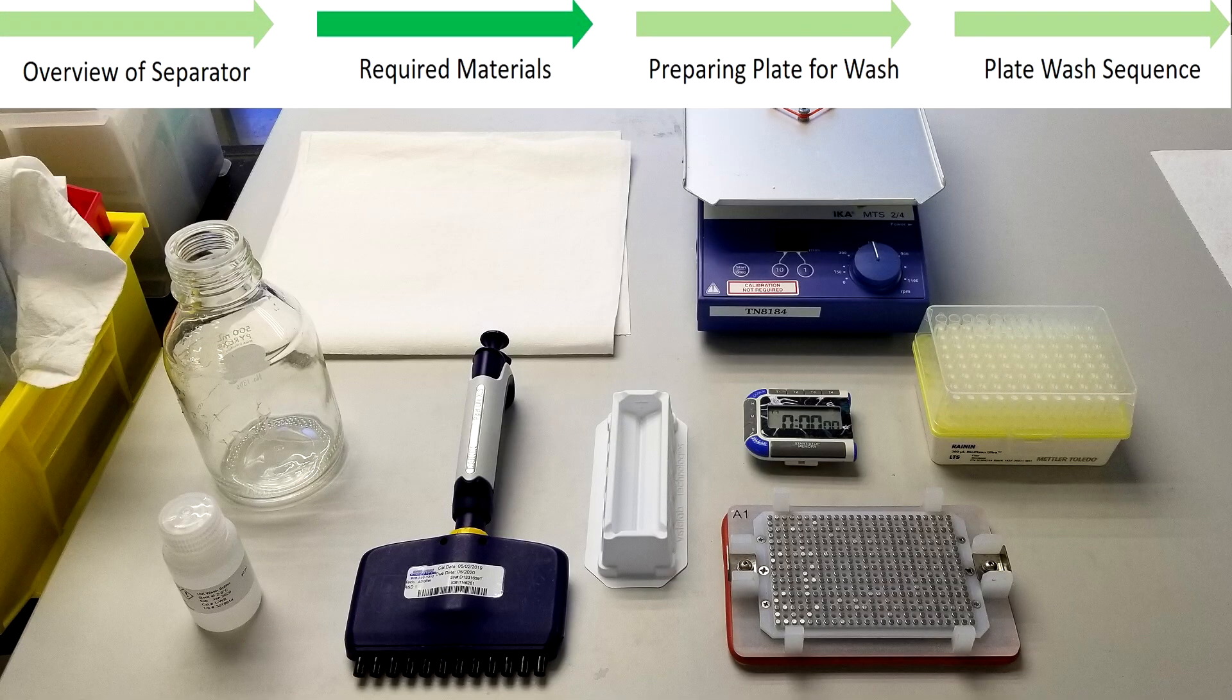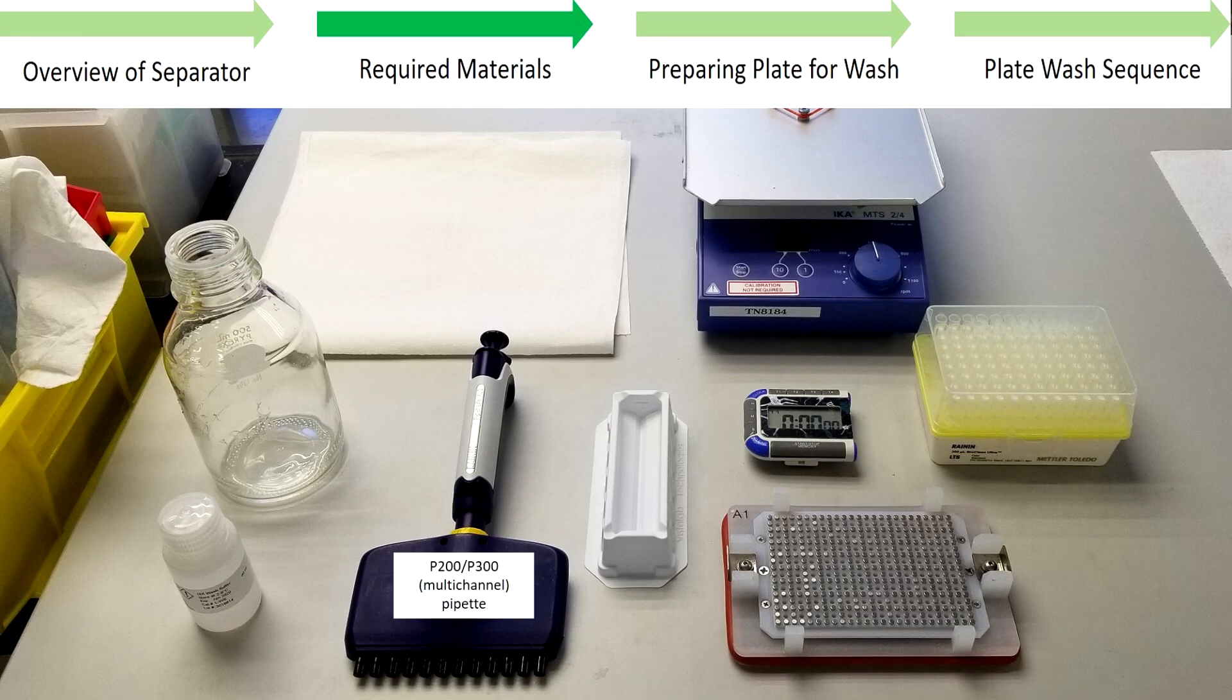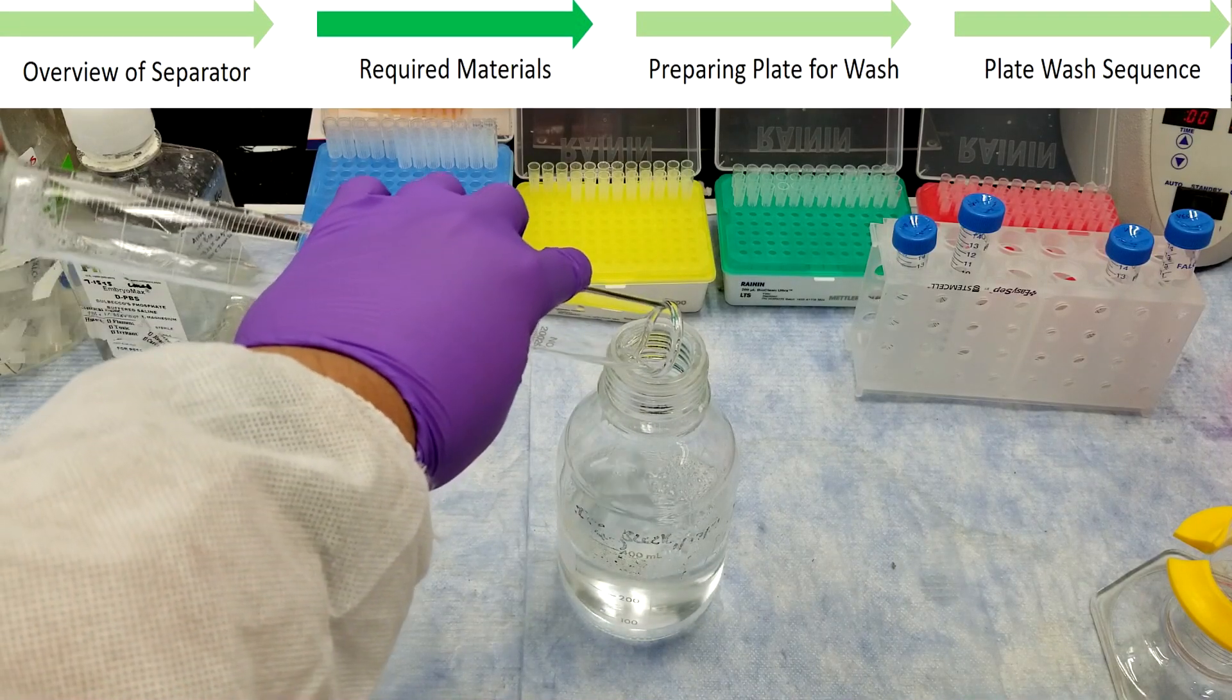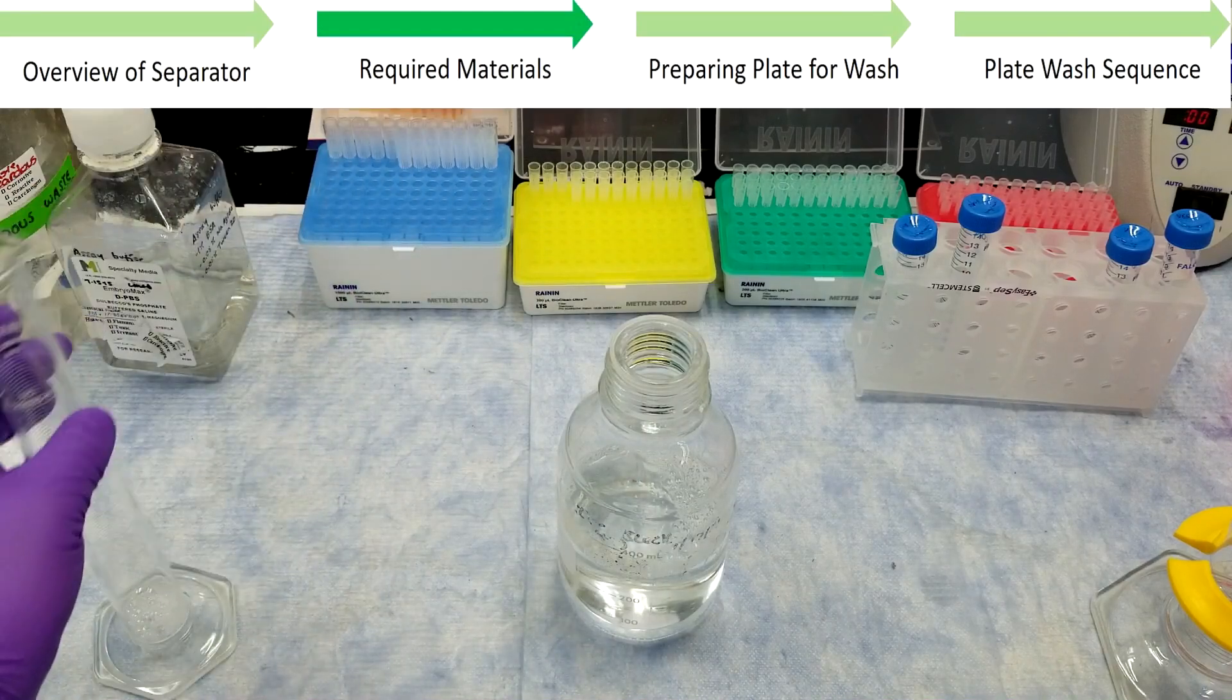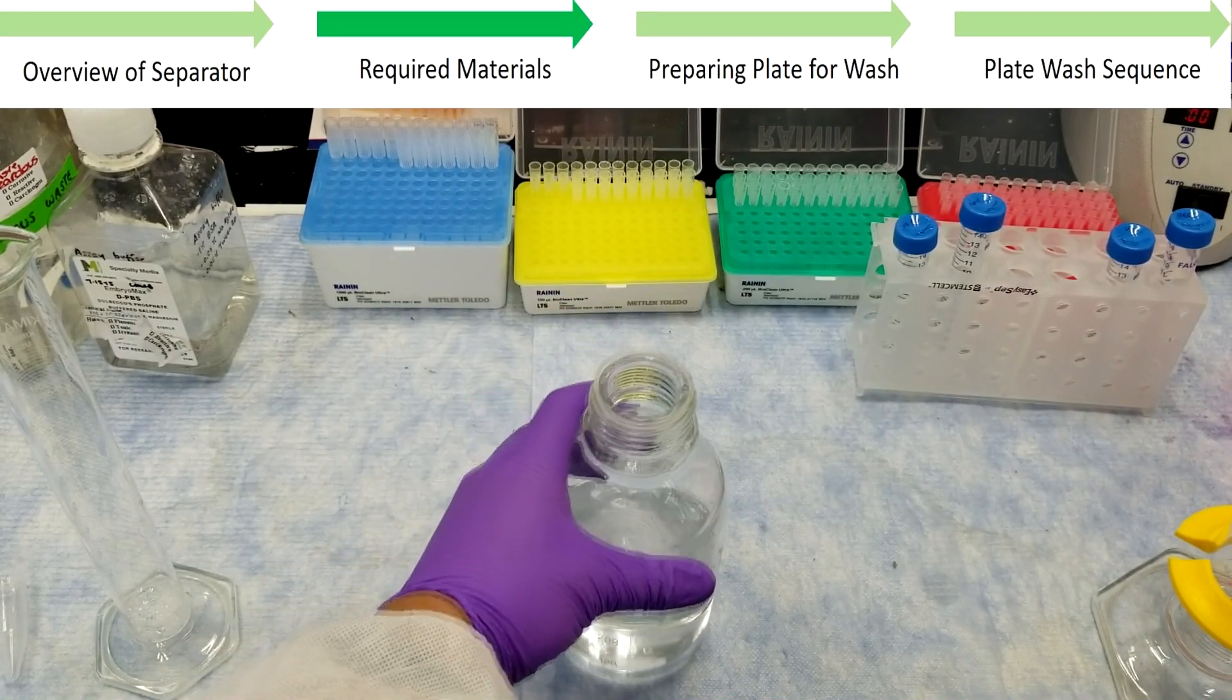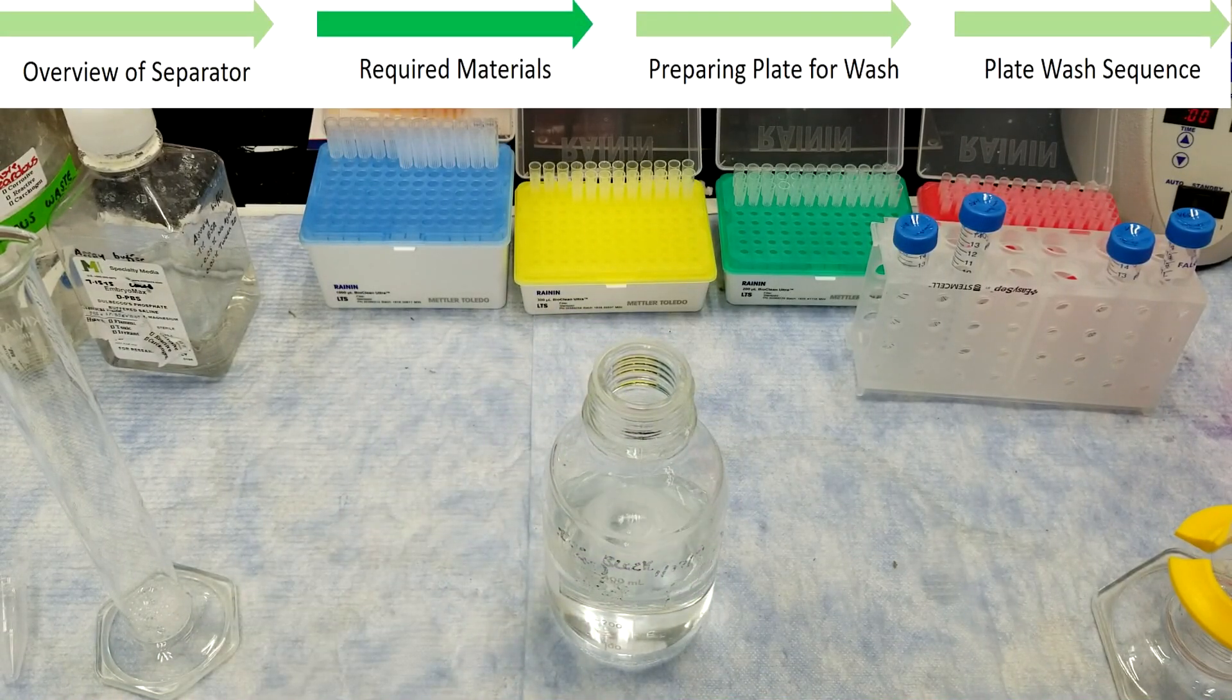Other materials you'll need to perform a MillPlex plate wash include a P200 or P300 pipette and matching tips, a clean reagent reservoir, a timer, an orbital shaker able to reach 800 RPM, clean paper towels, a clean bottle, and the 10x wash buffer included in the MillPlex kit. This 10x stock should be diluted 1 to 10 with deionized water ahead of time. 300 milliliters of 1x buffer should be sufficient for all washes associated with an assay.